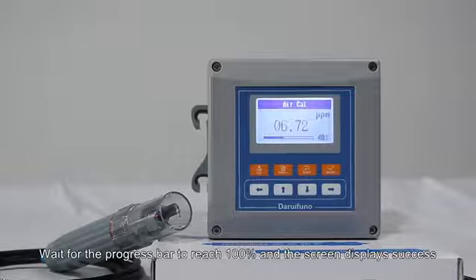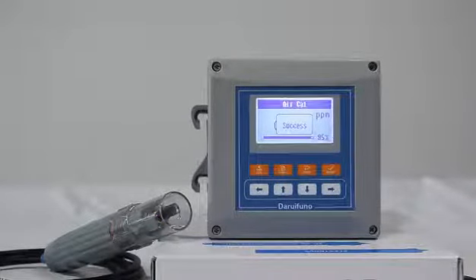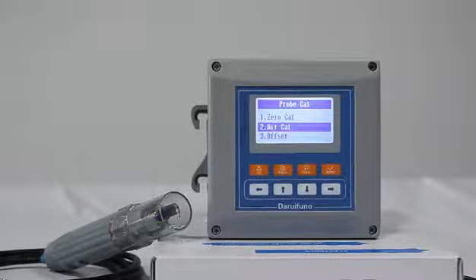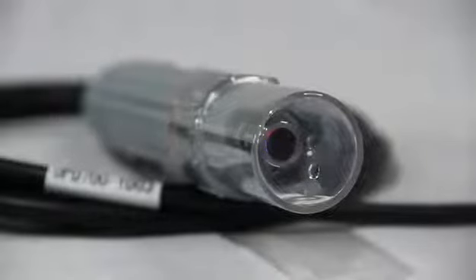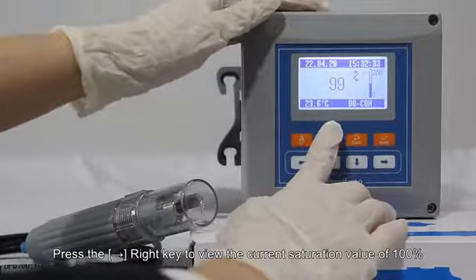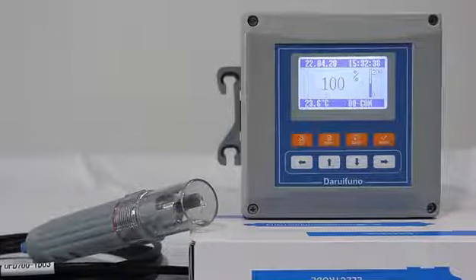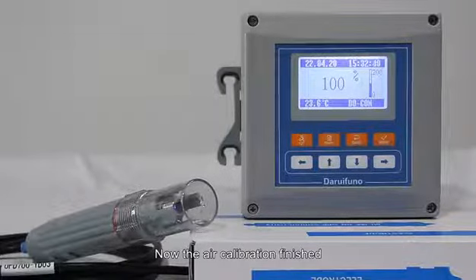Wait for the progress bar to reach 100% and the screen displays success. Return to the main measurement interface to view the current reading. Press the right key to view the current saturation value of 100%. Now the air calibration is finished.